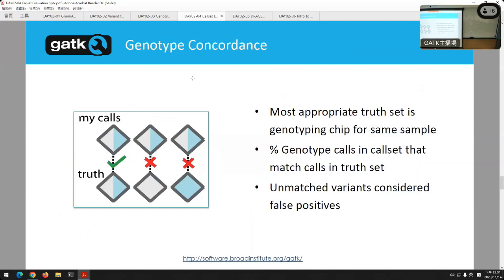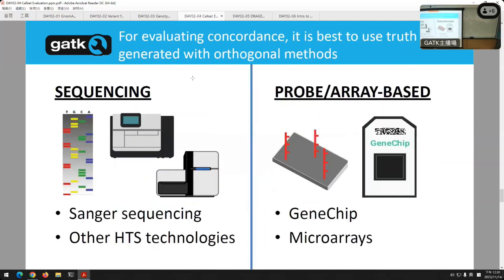It's worth noting that you won't always have a source of truth like that. Maybe you're not doing human sequencing, right? One of the things you can do to simulate a truth set is run the samples as much as possible through different sequencing technologies, similar ones, right? You don't want to jump too much, but even among short read technologies, different ones have different characteristics. Sanger is good; it's expensive but really high accuracy. Different technologies have their own different sources of biases.